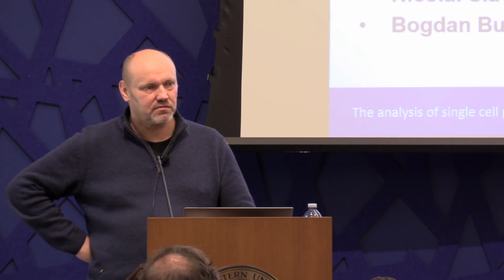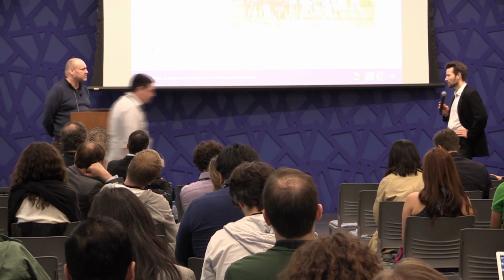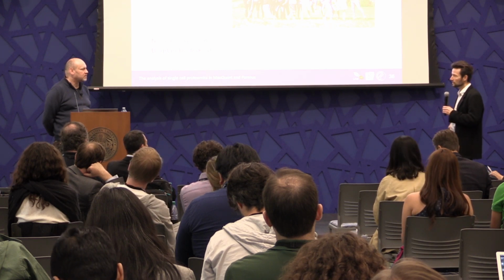So I have a couple of suggestions. I really want to generate strong data to benchmark the improvements that you're introducing. For one thing, it is clear that the PSM normalization will benefit if there are multiple PSMs per peptide or per protein. Currently, we don't try to do that because we want to have high throughput. It is very easy for us to increase them by a factor of 10, and then we can potentially see a much bigger benefit to evaluate how well it's performing.